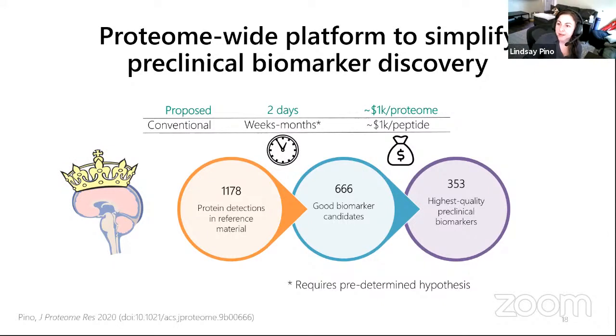Raja has a question. Protein copies per cell is being done using histone proteomic ruler and DDA LFQ. So the protein copies per cell that I had on those first slides, that's taken from a paper by Sina Ghaemmaghami. Great proteomics work, but this was like a Herculean effort in yeast where every single ORF, every single open reading frame in yeast was tagged, and they did actual counting to get those protein copies per cell. So we use that as the ruler in that case.